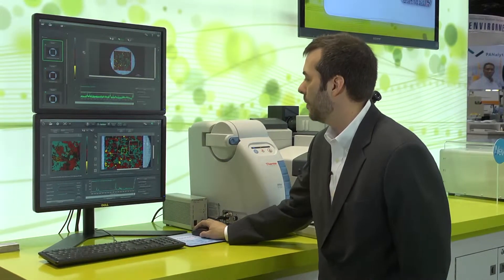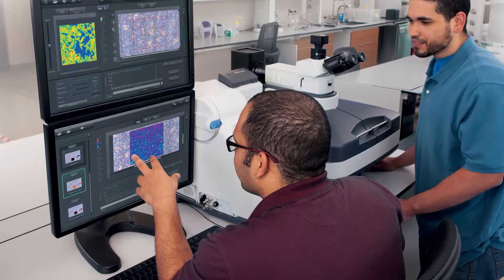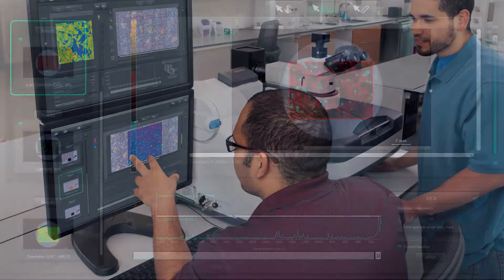It's just as simple as pointing and clicking and drawing out a few locations where you'd like to do in-depth analysis. And then you hit one button and go, and the data is collected and appears on the screen.